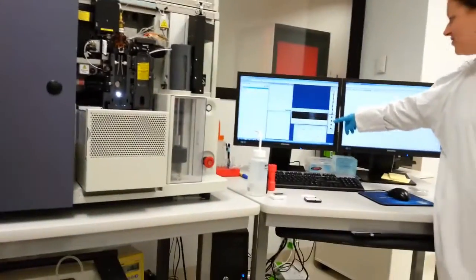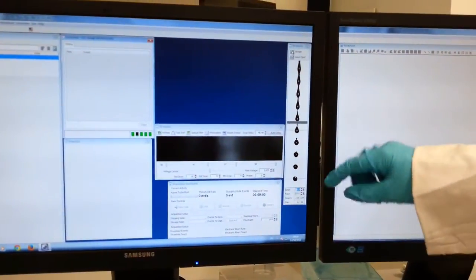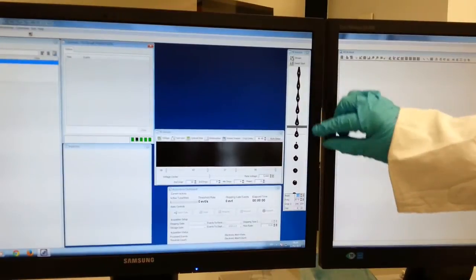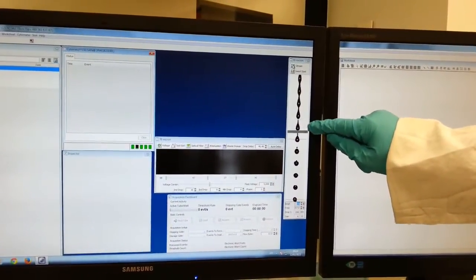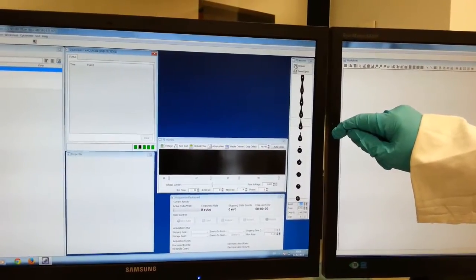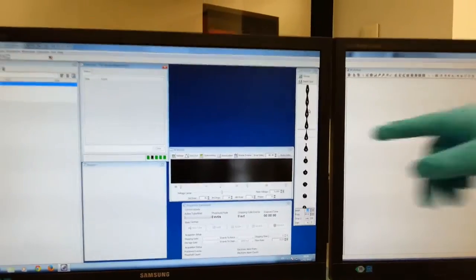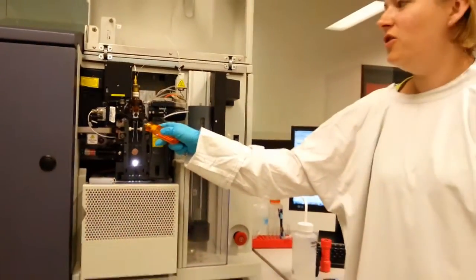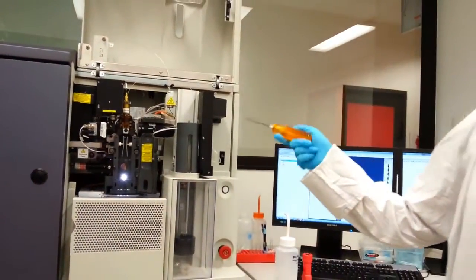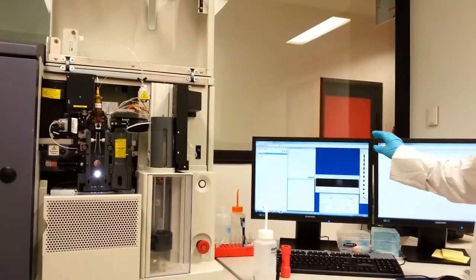And here is a demonstration, a digitized static image of those droplets as they are being formed, and then as they eventually break off. That little grey bar that's flashing around is supposed to show us the break off. We get this image because we have a camera here, a strobe camera, that also strobes at 87,000 times a second. And here is a static image here.